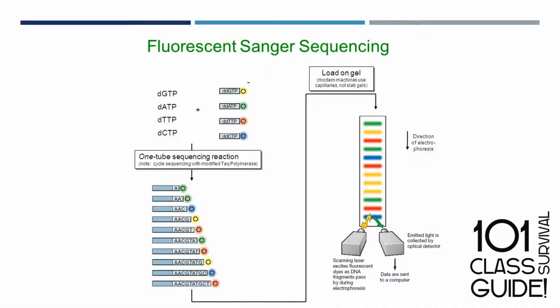These are those 4 dye-labeled ddNTPs. Each one is labeled with a different fluorophore: yellow, green, red, and blue, so that when the laser beam passes through them, they emit color or fluorescence. Each different type of dye-labeled ddNTP is incubated with normal dNTPs, and after the generation of different lengths of DNA segments, they are passed through a column and are separated on the basis of their size.